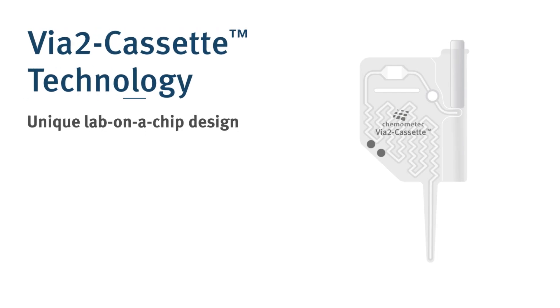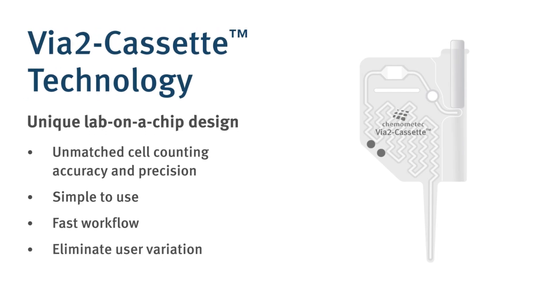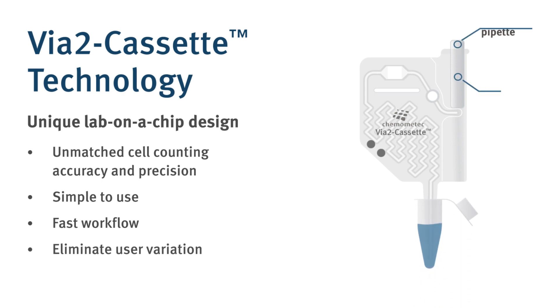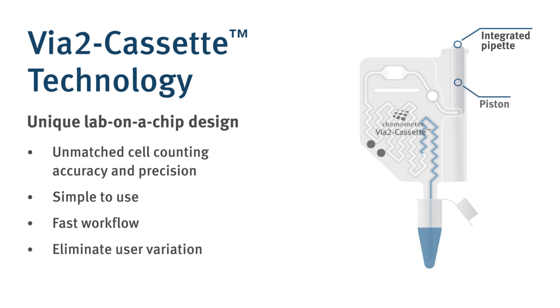Simple and fast workflow with the VIA2 cassette. Insert the VIA2 cassette tip into the sample. Aspirate the sample by pressing the integrated pipette.